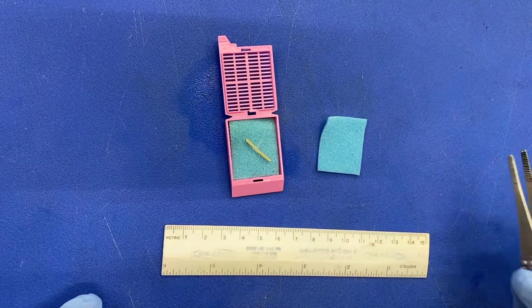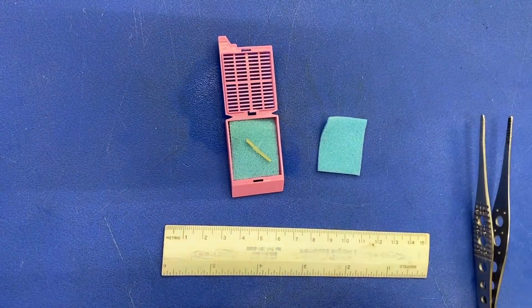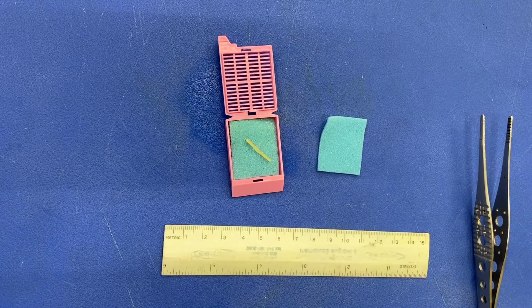Measure and describe the specimen. Since needle core biopsies are solid tubes, they are measured in length and diameter.